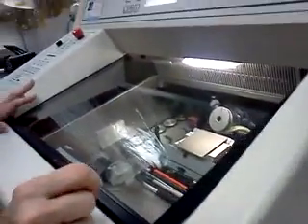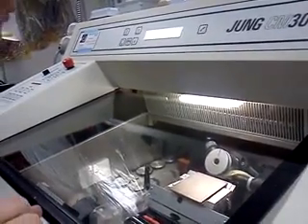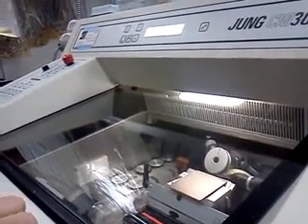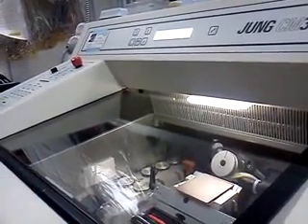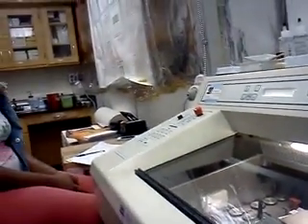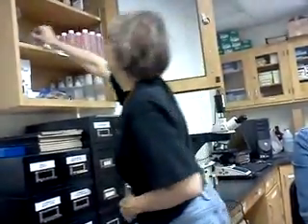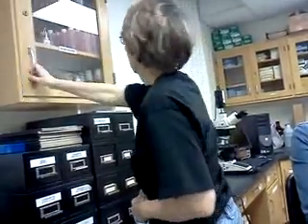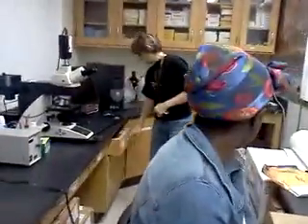What would we have to order if we order anything? The OCT. Just the OCT. And then right now, how many sections are you going to be cutting? I've got 16 samples. So right now, I think I'm okay on blades because I've got backup. I think you're okay on blades as long as you don't use up a whole thing of blades, which is quite a few. If you do, you might want to order blades. They're pretty expensive, but if you don't use up a whole one, it's probably good.